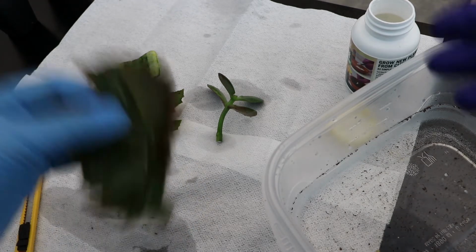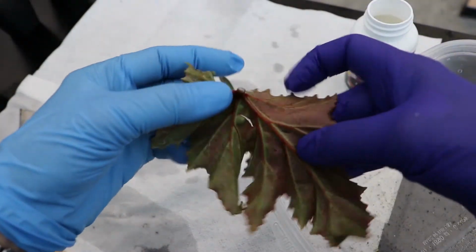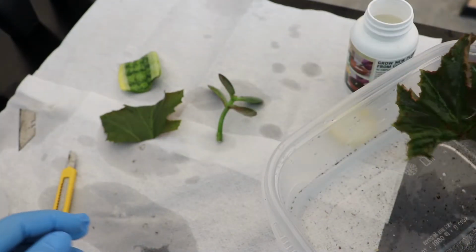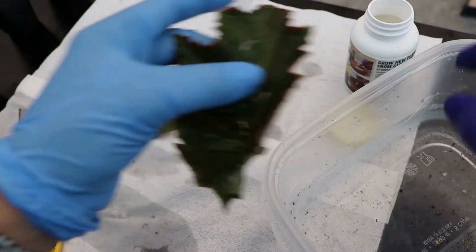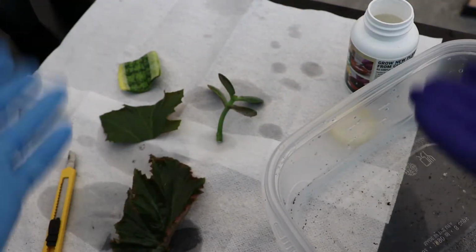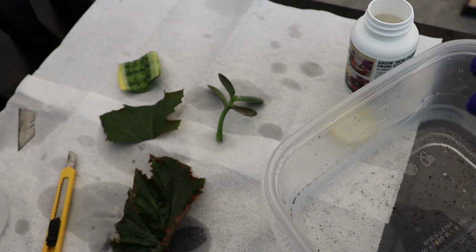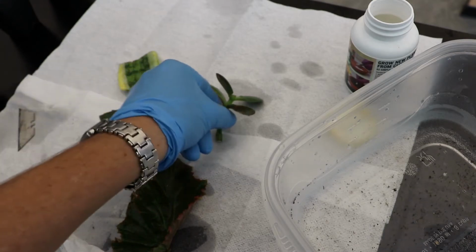And then when we think about the plant material themselves, we have clean instruments. We also want to make sure that we surface sterilize these plant material before we put them in the rooting area. So this is like a 5% dilute bleach solution. There are, of course, lots of commercial materials that you can use, but this bleach solution is a good place to begin. We can either air dry or towel dry those.